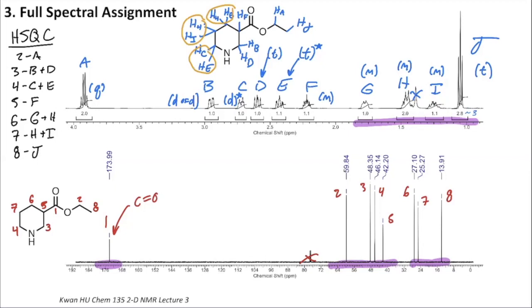And in my video where I talk about the splitting of these in more detail, I talk a little bit about the different positions in, say, a chair structure. So thinking about axial, equatorial, and that kind of thing. We wouldn't try to ask you to distinguish which proton is axial or equatorial or up or down for this type of post lab assignment or practice example, because maybe we could do it, but it's just way more than we need to do. Especially for this example, we don't know anything about the stereochemistry here. So while we could maybe make some assumptions and parse through with what we know about the splitting, we're not going to ask you to go to that depth with your analysis.